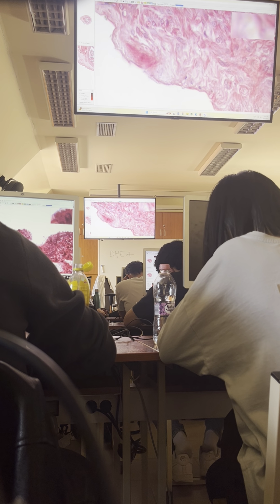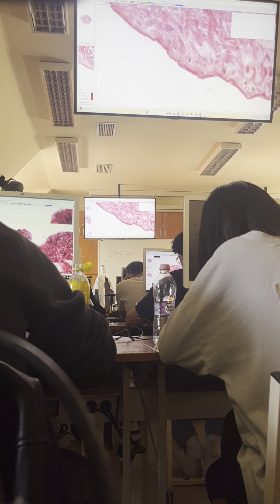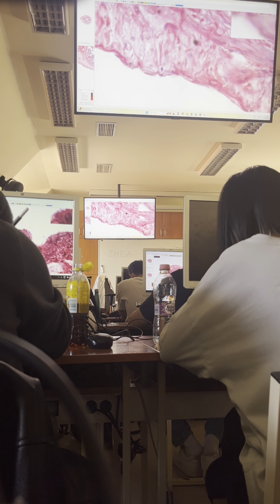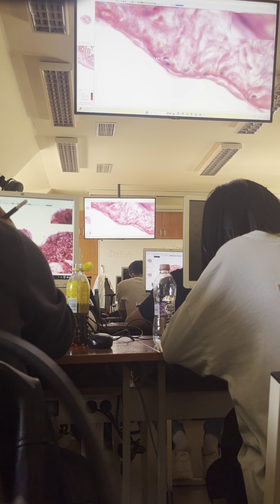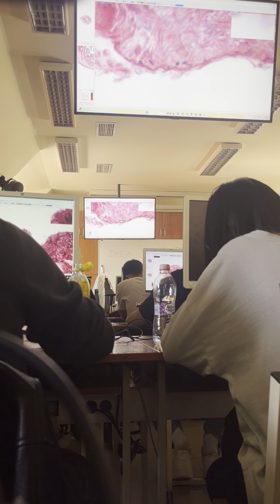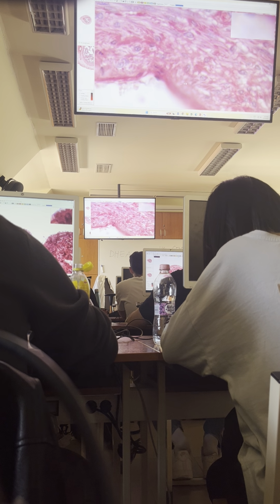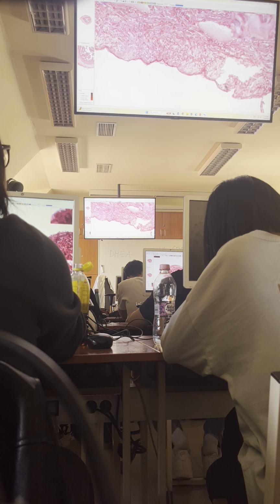So this is subserosa. Well, serosa is not always visible because we tend to lose mesothelial cells, maybe one nucleus is here, but the other section we could see more actually.